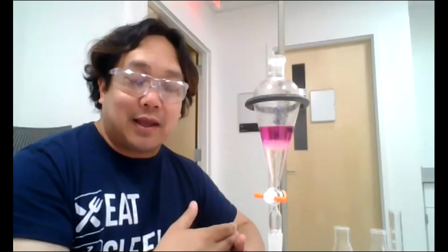Now you could say the layers are water and cyclohexane, or you can say the layers are aqueous and organic. Okay, the layers are not going to switch places. So if your organic layer is less dense at the beginning, it's going to be less dense at the end, no matter if anything is dissolved in it or not.